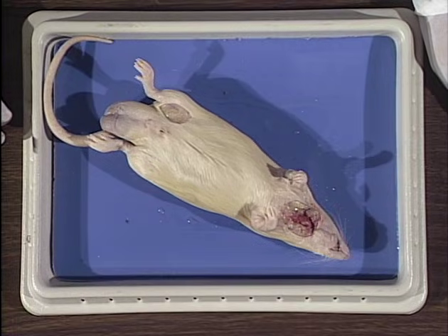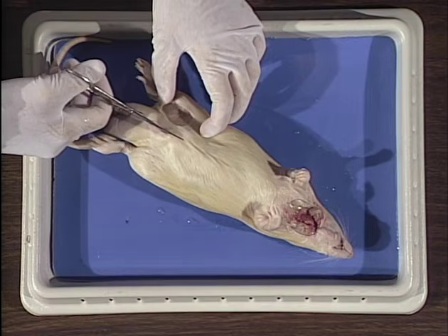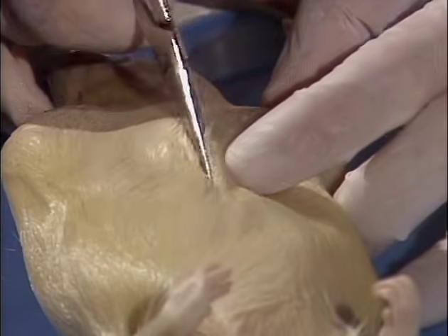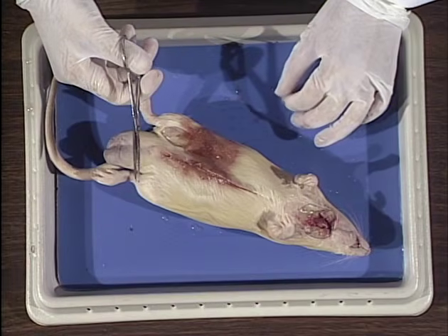We are now ready to begin the digestive system. To do so, we must make an incision along the mid-ventral line. Using your scissors, cut up the mid-ventral line from the pelvis to the sternum. Now we need to make two transverse cuts.